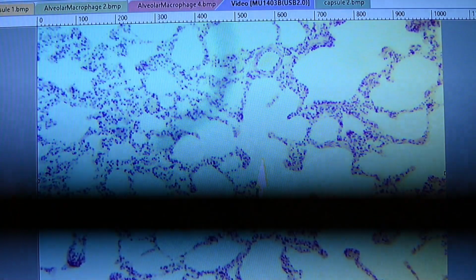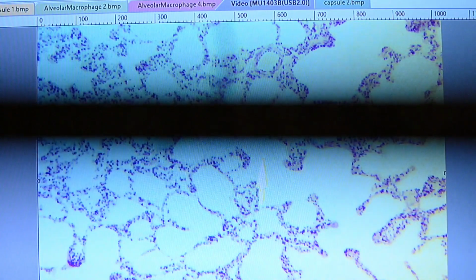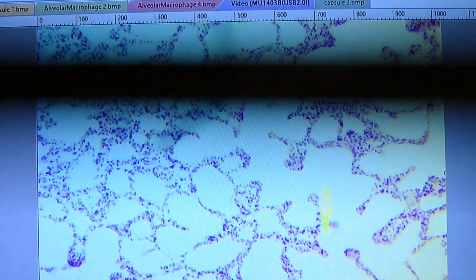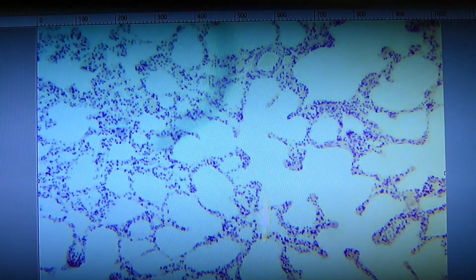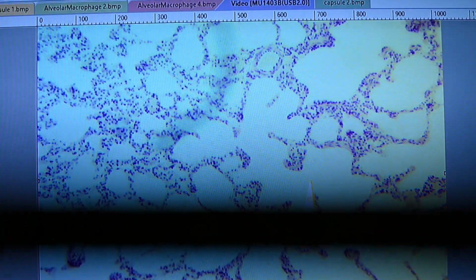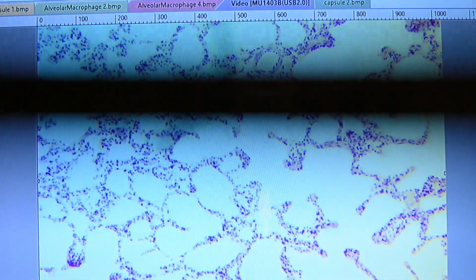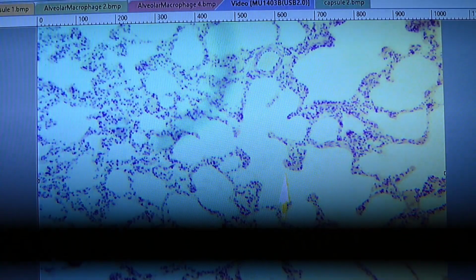Here's another alveolar duct. You can see that there are alveolar pouches, outpouches from that central space through there. So there's kind of a continuous connected space all the way from this side down over to this side. We didn't catch exactly where it connected to its bronchiole that leads into this alveolar duct, but we can see the alveoli. There's 3 in a row right up in here, these little pockets all around that alveolar duct. So we'll go in and we'll look at the walls of some alveoli next.